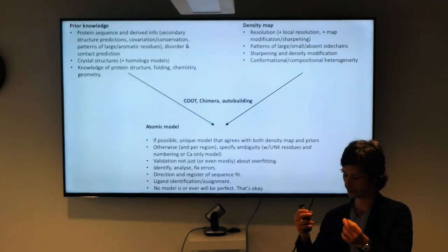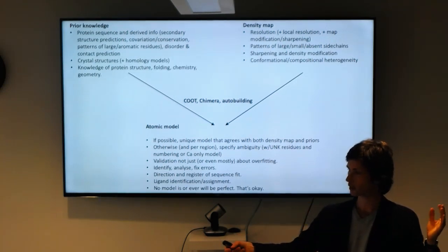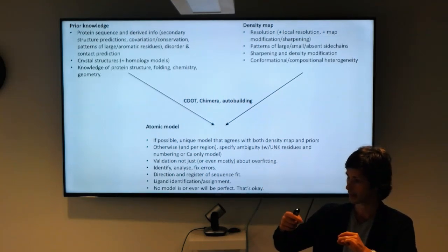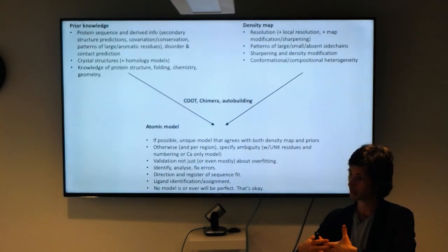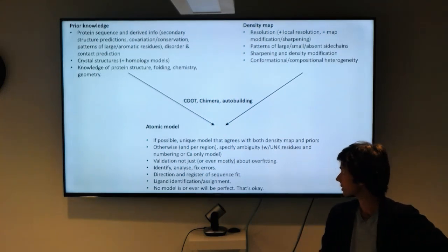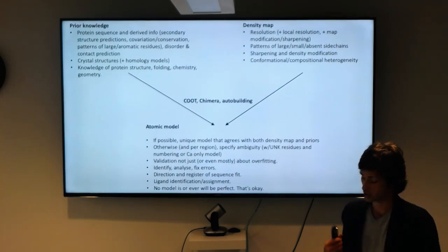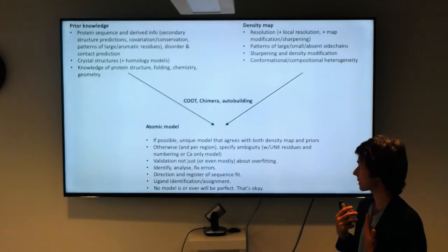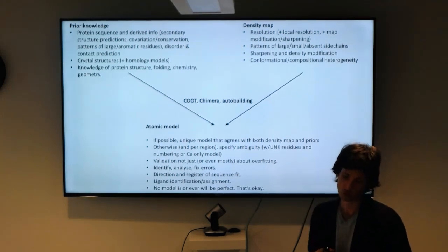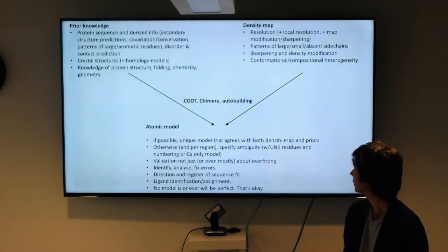The idea being that if you have, let's say, an arginine in position 1 and a glutamate in position 100, and whenever they're substituted, those two positions swapped around, that's indicative that there might be a salt bridge between those residues, and you can create distance-based restraints based on that. And of course, patterns in the sequence, patterns of large and small residues, and knowledge that you have of the folds of similar sequences that you can find from looking at bits of your sequence.